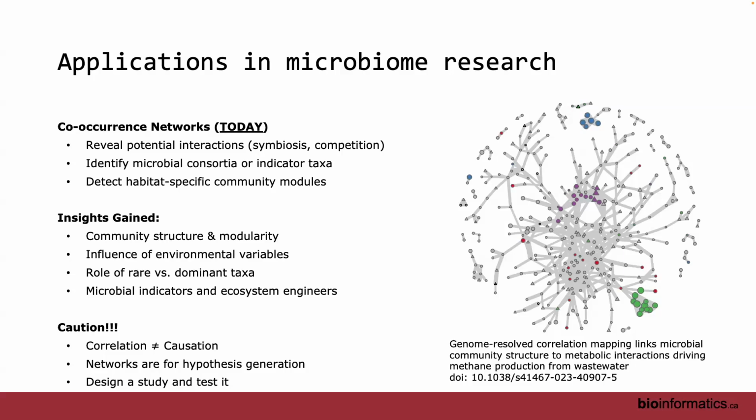One of the cautions that I'd like to really underline, and Morgan has underlined this as well with other things that we do, is that these are not facts. These are all hypothesis generation. So correlation is not causation. This is going to give you ideas about what a community is doing. It's going to help drill even deeper into those interactions, but you have to come up with studies. You have to come up with tests that actually test what you're seeing. So it's very important that this is just hypothesis generating, although it can be extremely, extremely helpful.